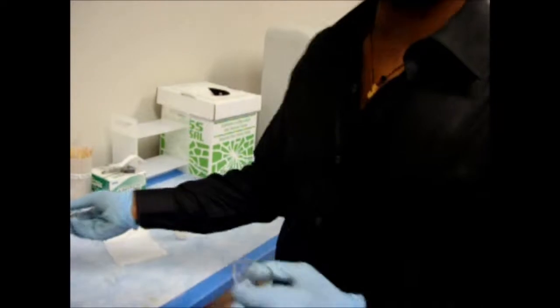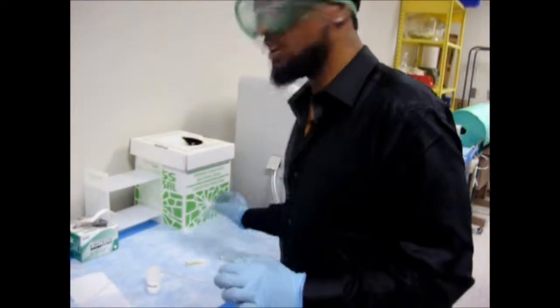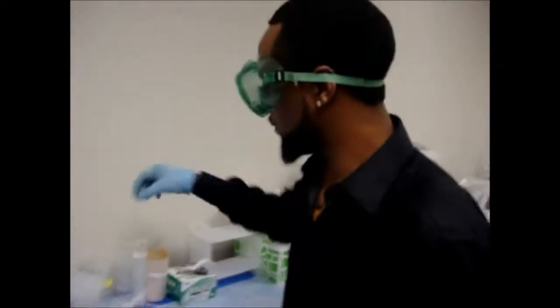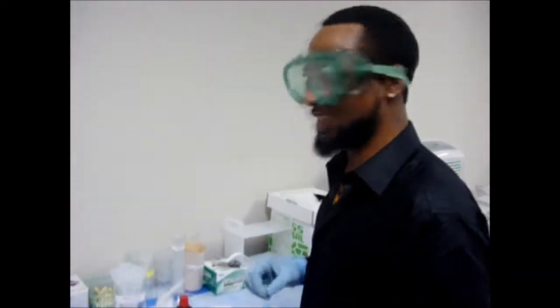And then obviously you don't put this back in here because you would cross-contaminate that. We'll just do that right here, and then we'll throw that away. Okay, it seems like it has completely dissolved. So the very next thing we'll do is to prep it so we can put it into the NMR machine.